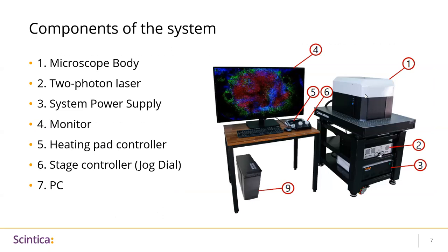Now that you have a little background about the techniques, I'm going to talk about the components of the system. Like other microscopy units, this comes with a microscope body — the black and white box — and underneath is the two-photon laser box along with a system power supply. It comes with a computer and screen to monitor, a stage controller to control the motorized stage, and a heating pad controller for animal physiological control.